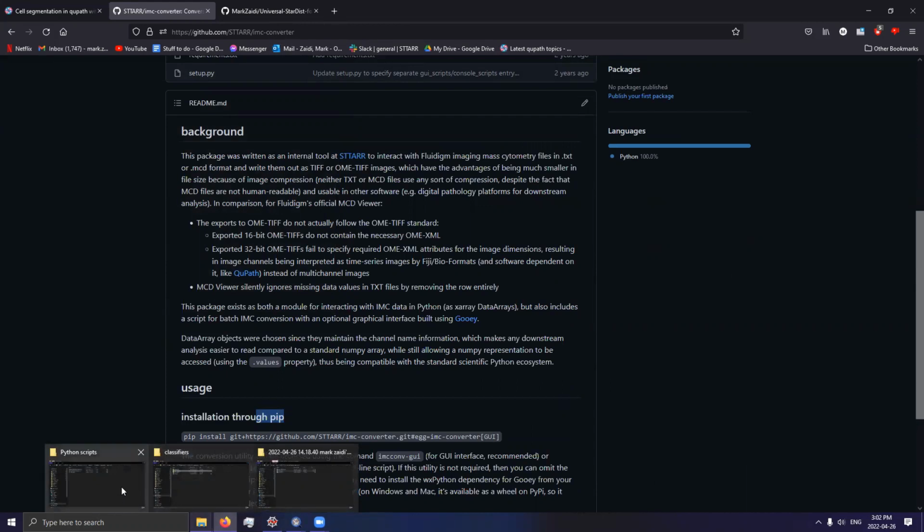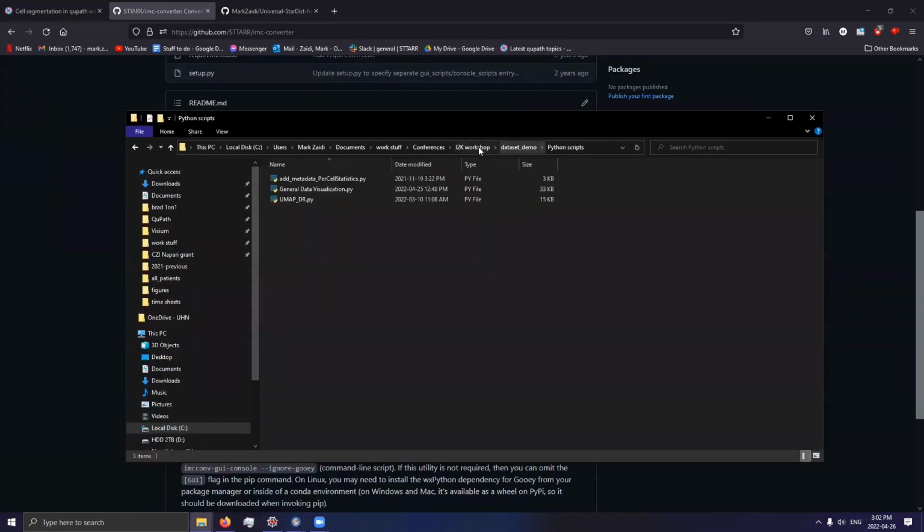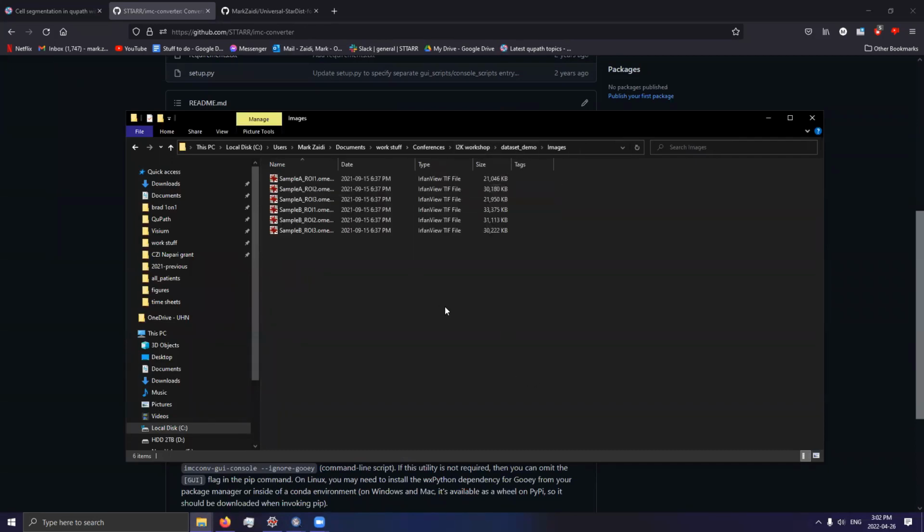I can find this as located here. So these images are what I'll be making publicly available. And again, they've been de-identified. There's no patient information in these images, but they are of human glioblastoma. So they'll become publicly available. Anyone can download them. They're fairly small, despite having close to 20 different channels.